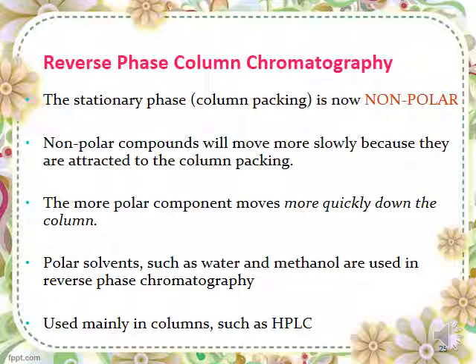Now, what does reverse phase mean? Reverse phase means the opposite. Initially, the stationary phase is polar. In reverse phase, the stationary phase is now non-polar. Therefore, if the stationary phase is non-polar, it will retain the non-polar component, so the polar component will move faster.